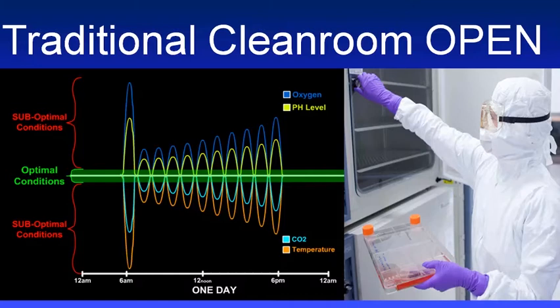And even in the pinnacle of the highest technology we have for processing cells, the cleanest clean room in the world, you still have the same sources of variability that go into the most rudimentary of cell culture labs anywhere in the world when you're exposing these cells to room air conditions. And in a clean room, because people have to wear so many layers of garb, they often keep them really cold, and that's even worse for the cells. So this is the ultimate in people-centric environment, not a cytocentric environment.